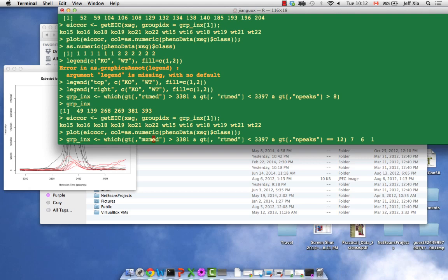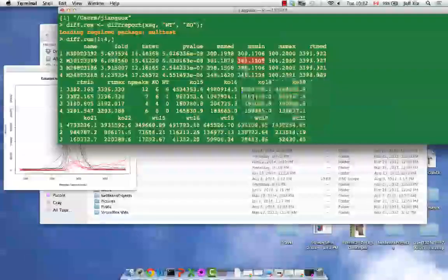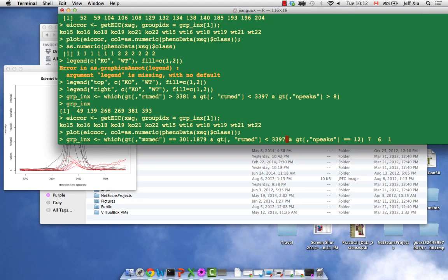Now we are doing m/z, okay? We try to see if we can get equals, but this is kind of dangerous because R showed some values with more digits, and if we copy them up here, it could be not exact. So a range is better. That's right. Let's go back to the... Let's use this one, and copy that.